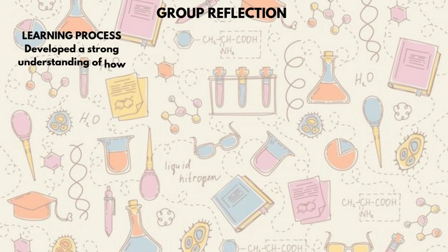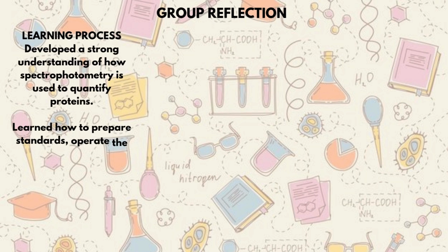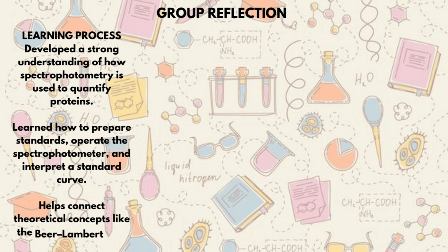From the practical, we learned to develop a strong understanding of how spectrophotometry is used to quantify proteins. We also learned how to prepare standards, operate the spectrophotometer, and interpret a standard curve. It also helps connect theoretical concepts like the Beer-Lambert law to real laboratory work.